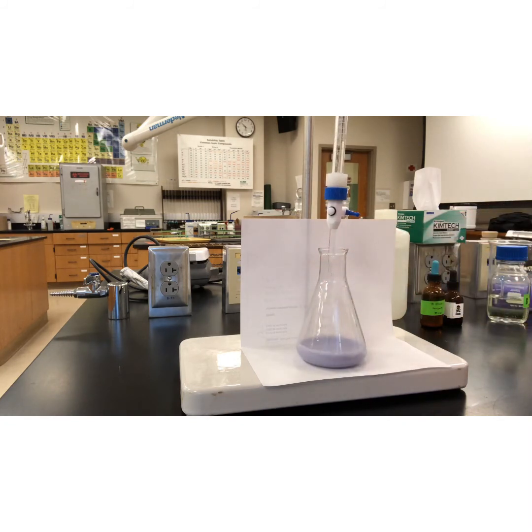All right. So that endpoint is 19.25. So 19.25 for that final volume.